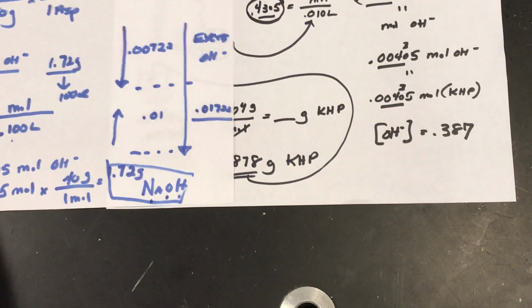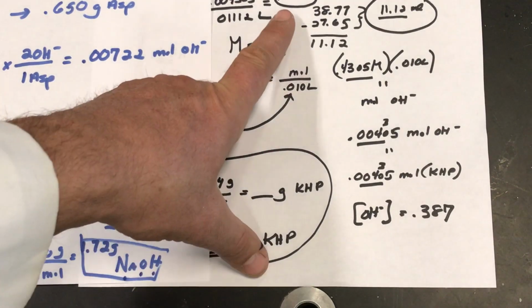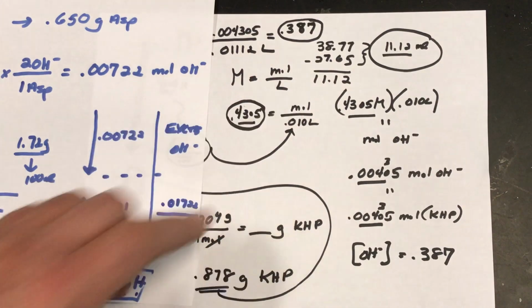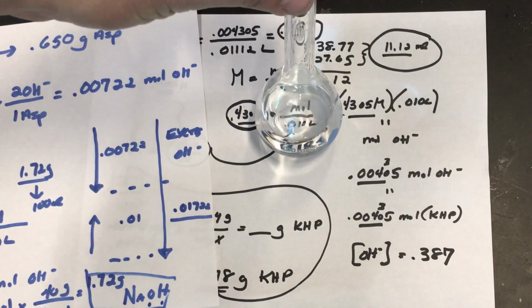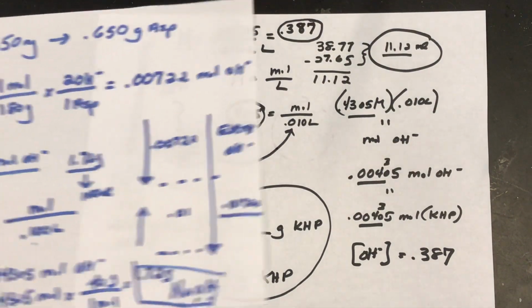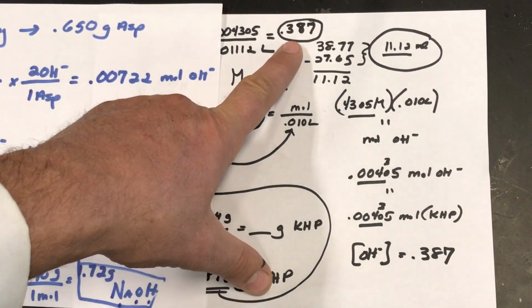Well, because it's weaker, okay, we're gonna need a little bit more, okay? So just be careful. So let's figure out exactly, just for fun, how many milliliters of our base solution, which we've made already in part one, we need. We thought we would need 40, but we're gonna need more because by standardizing it's less.